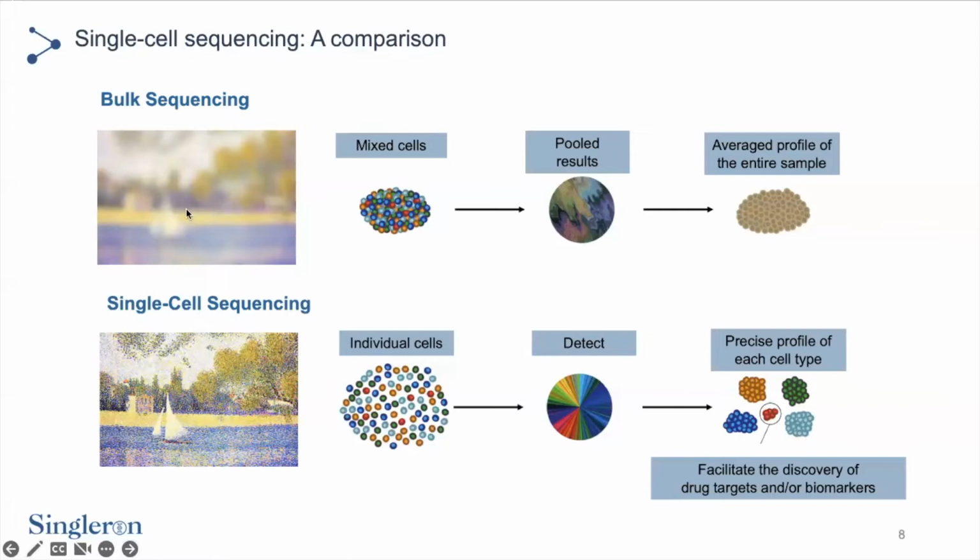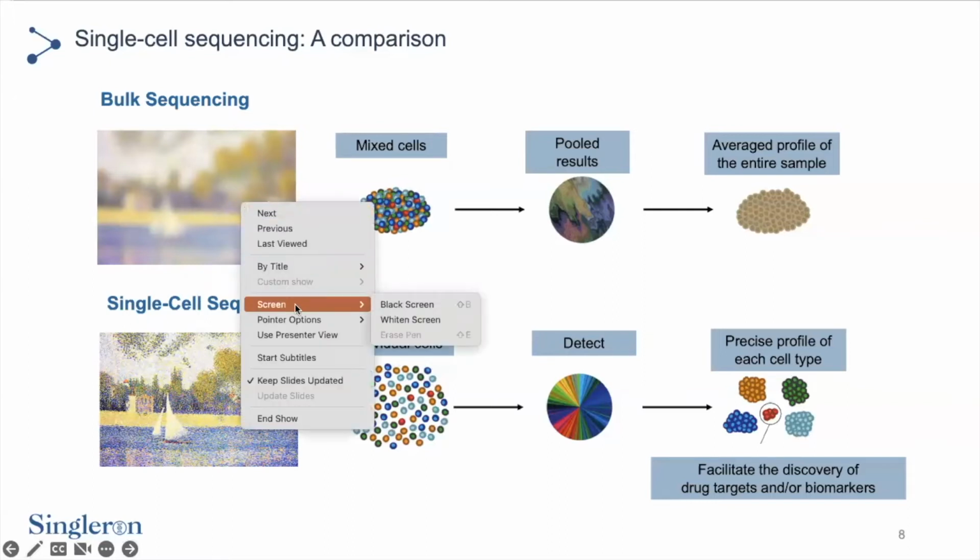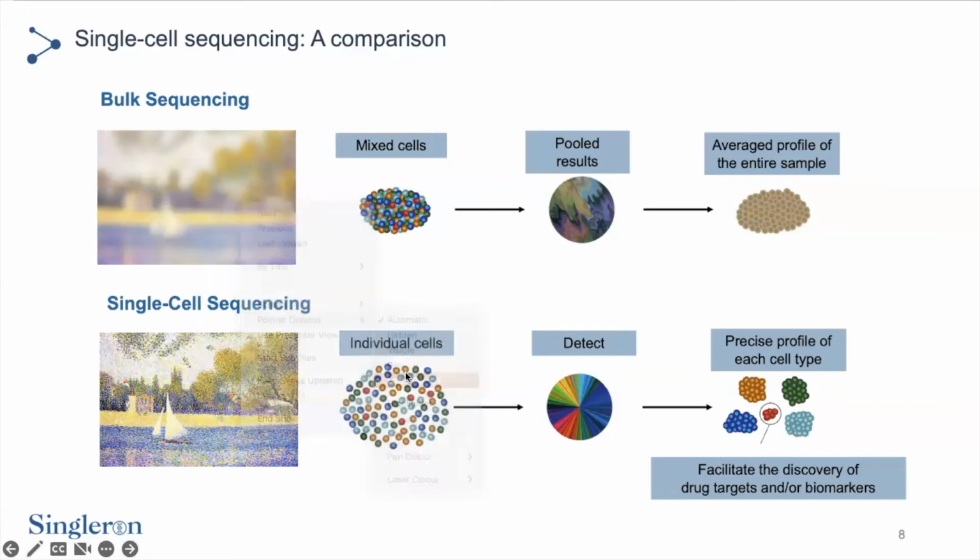You can see some green and some yellow. Let me turn on my pointer so you can also see. So you can get information from these parts, and maybe some gray and kind of dark colored sky. But the thing is, you will get information from mostly overrepresented cells.